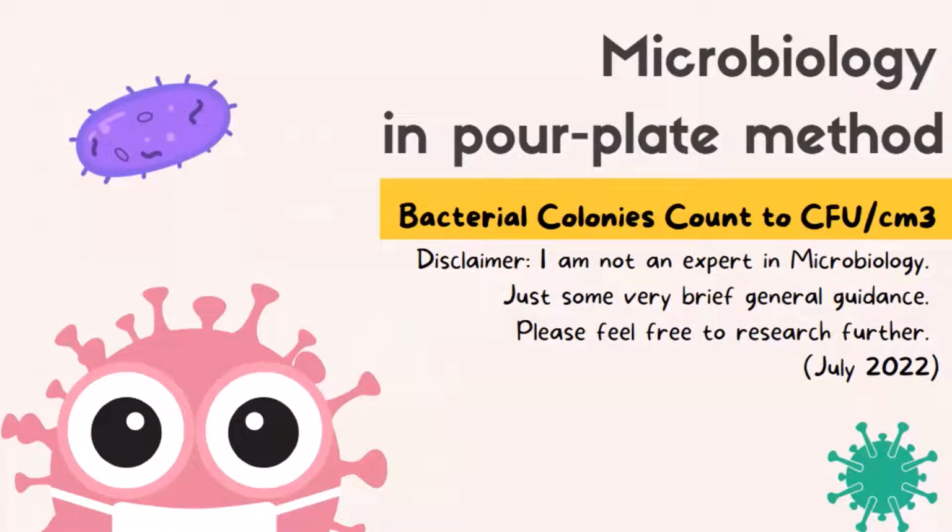In this video, we will talk about microbiology in the pour plate method, as to how we convert bacterial colony count to what we know as CFU, so it's colony forming unit. Usually we measure in CFU per cm cube or CFU per mil.